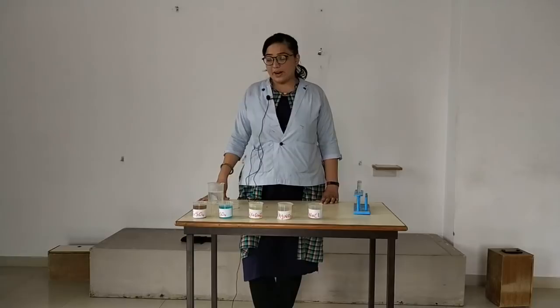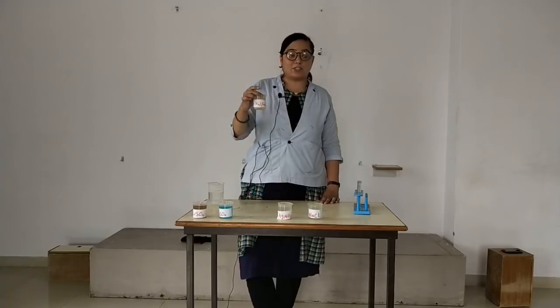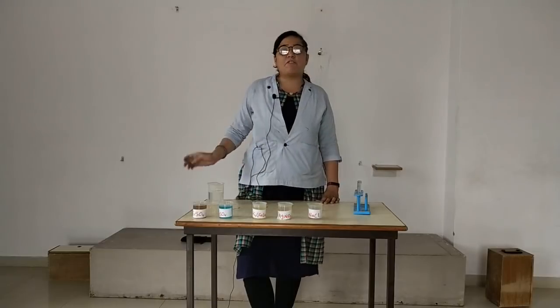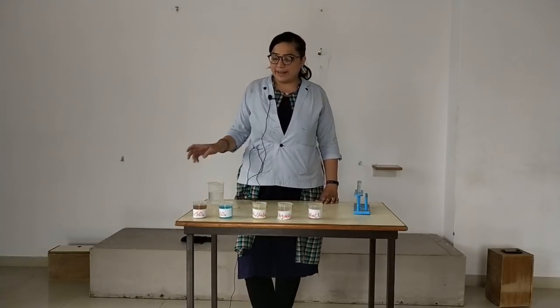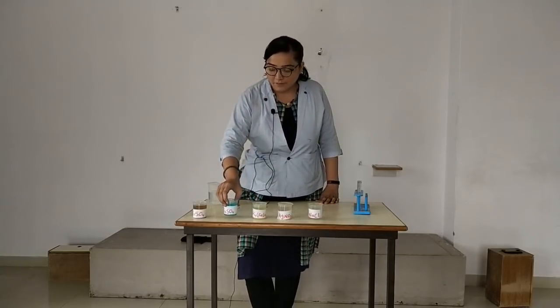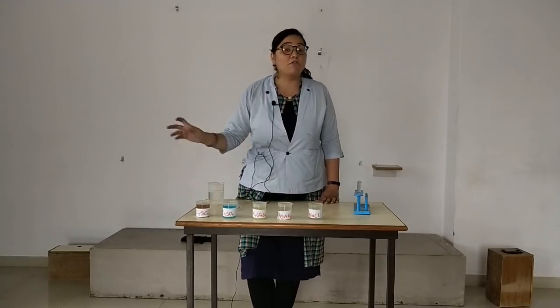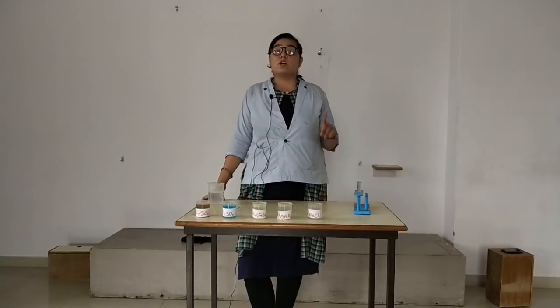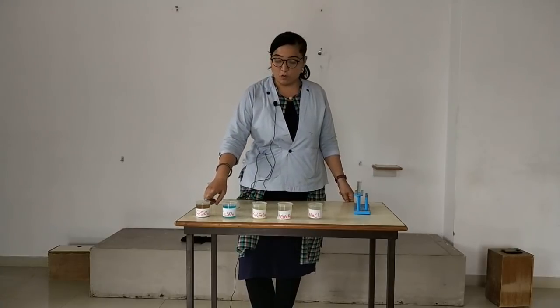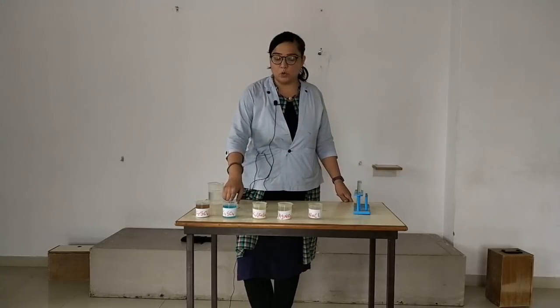The next one you have is a ferrous based complex salt, that is K4Fe(CN)6, which is potassium ferrocyanide. The next one is this CuSO4. After that you have FeSO4 solution. I hope the colors of all are visible to you. You should never forget in your life how the FeSO4 solution is colored? Almost brown. This is blue colored.